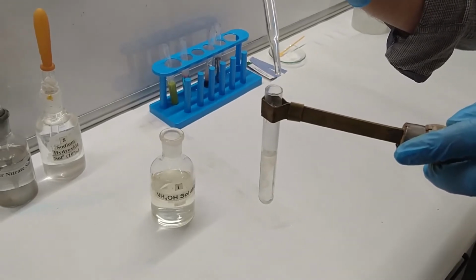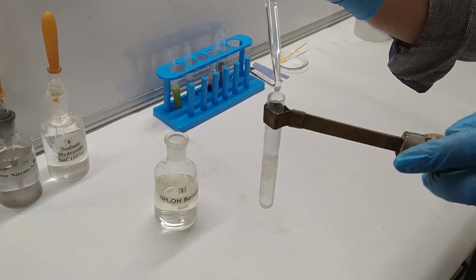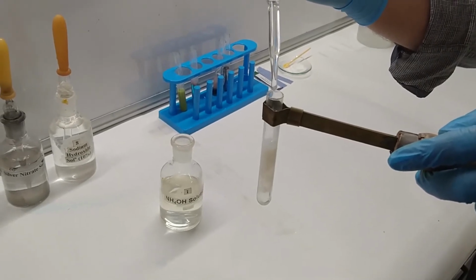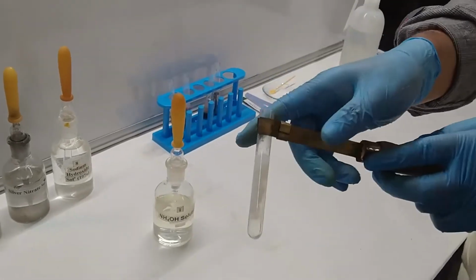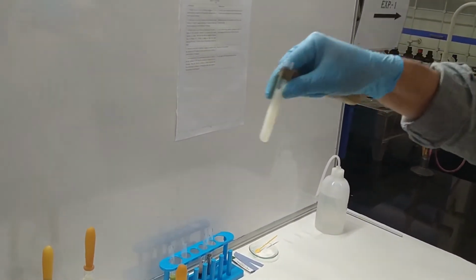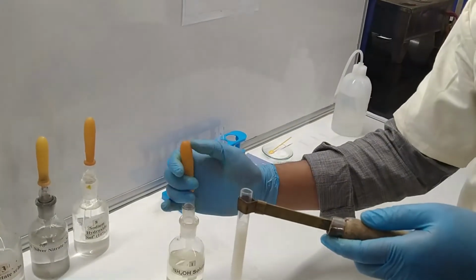I have to add some drops more for a permanent white color. Let it shake first of all. Then I am going to add again some drops of NH4OH.